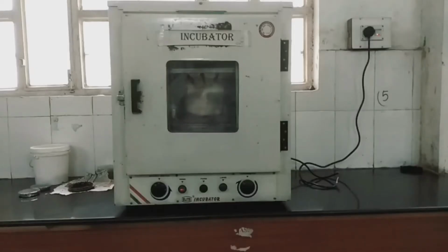Now let's see how it works and how we have to work on it. Okay, so this is the incubator. Firstly we have to open it, and secondly we have to place our Petri plates in an inverted position, or the broth in that, so that the growth will occur after 24 to 48 hours. We only have to place our culture media or the pure cultures, so that they will grow in a particular interval of time.